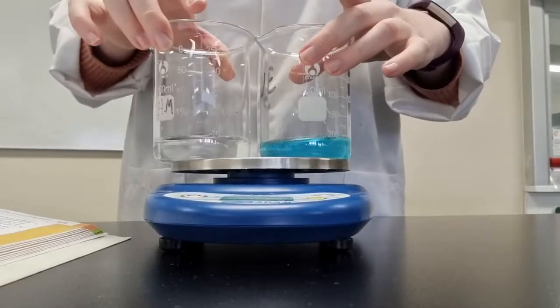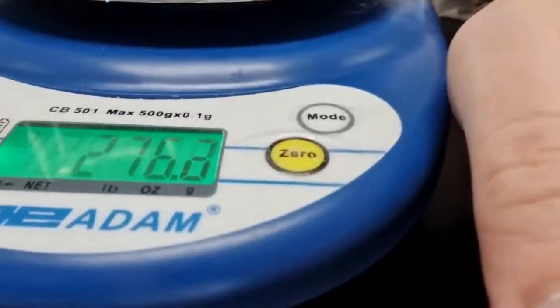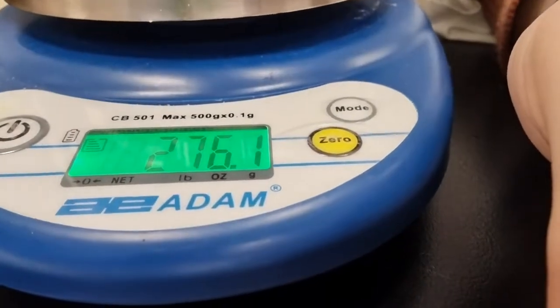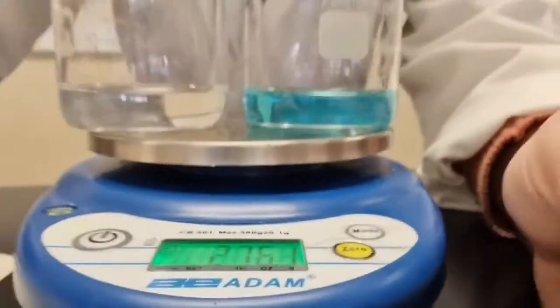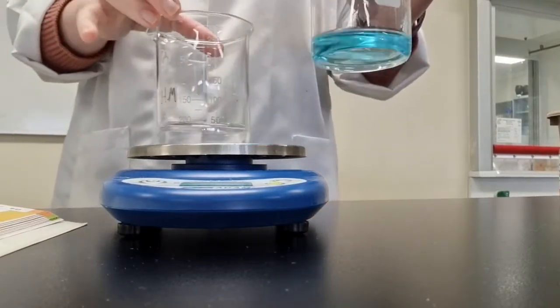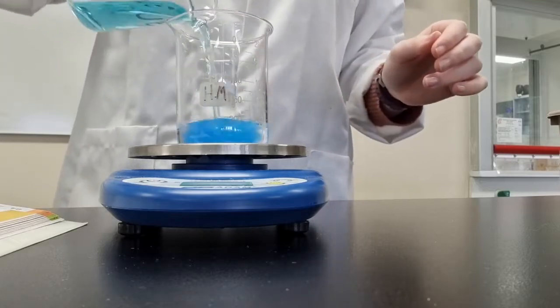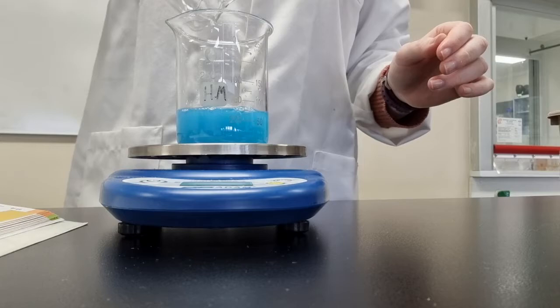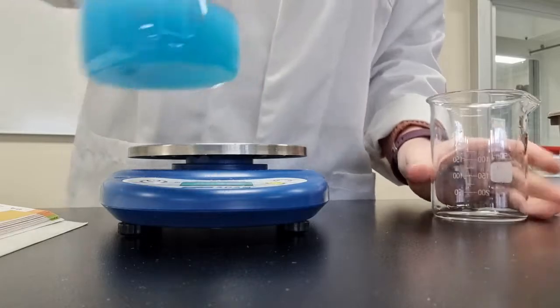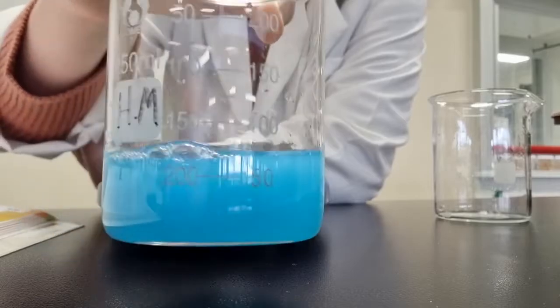So I'm going to weigh that on my electronic balance, and you need to record a mass of 276.1 grams. I'm going to pour my copper sulfate into the ammonia. You need to observe what happens. I don't know why I keep putting it over there. So again, we've got a color change, and it's gone quite cloudy again.